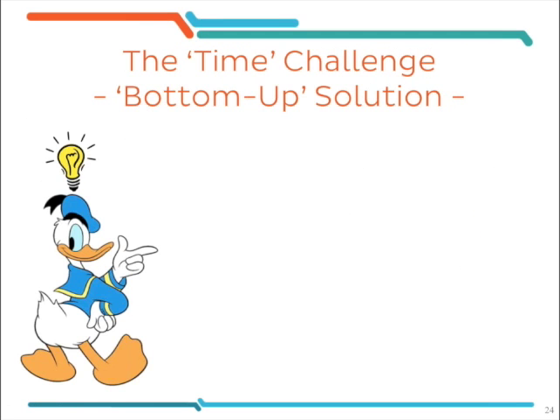Now, one way to increase throughput is to switch from a top-down method that needs all these different steps and iterations, to what we call a bottom-up method. So instead of first making the large particles and then breaking them down into smaller ones, the idea is to directly form nanoparticles of a defined size from the single building blocks, which in our case would be the single lipid molecules.